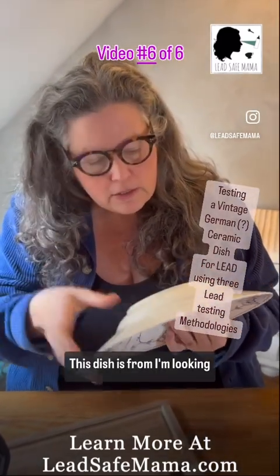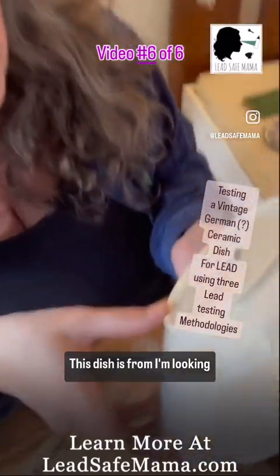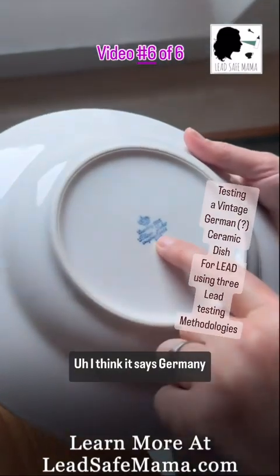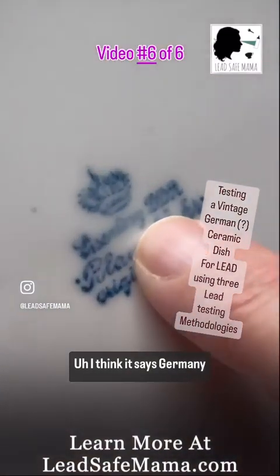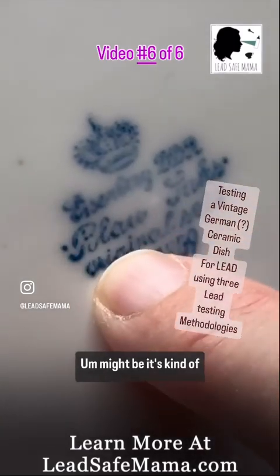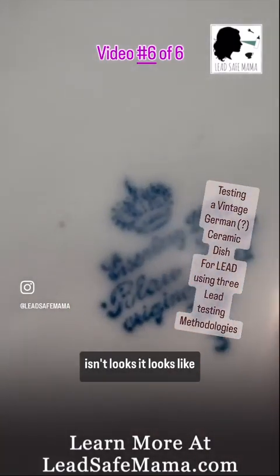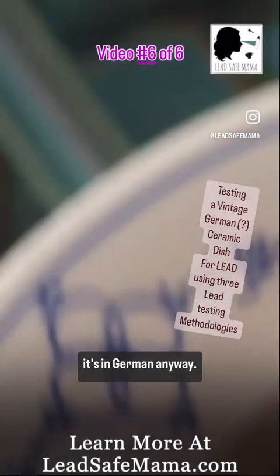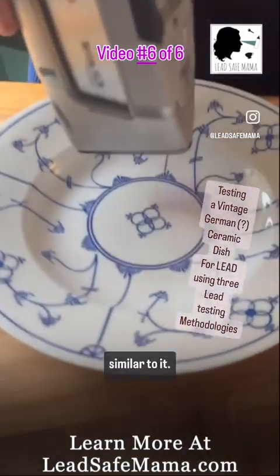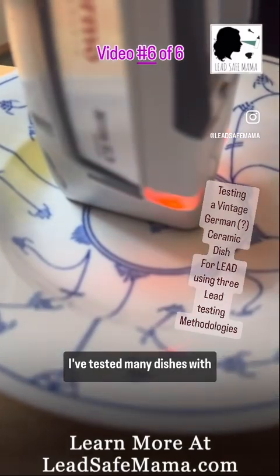This dish — I'm looking trying to see — I think it says Germany, I'm not sure. What do you think, Avi? It looks like it's in German anyway. This is, I believe, the Finlandia Myla pattern or similar to it. I've tested many dishes with this pattern.